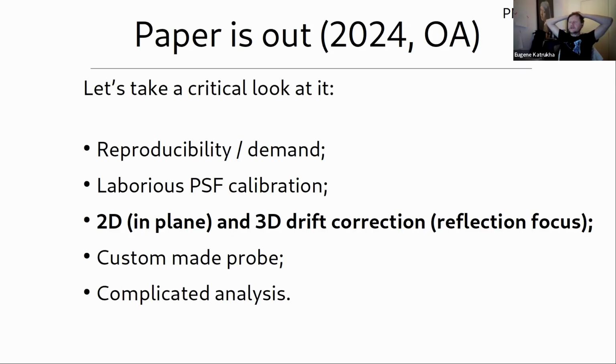But in the latest light sheet systems, I think in a recent Zen version, reflection focus was implemented. So you can use reflection from the coverslip to go back to the Z that you chose in the beginning. And that really helps, so at least in this case your sample will not drift away. This is one of the scariest stories: after 2 hours of acquisition, you see that your sample gradually goes out of the focus, and you realize that everything needs to be started again. So that's a really nice feature.